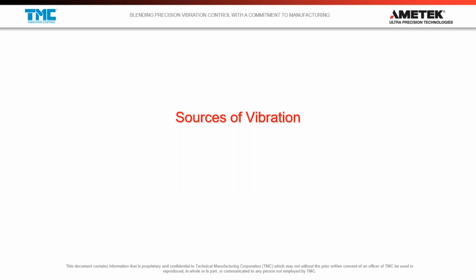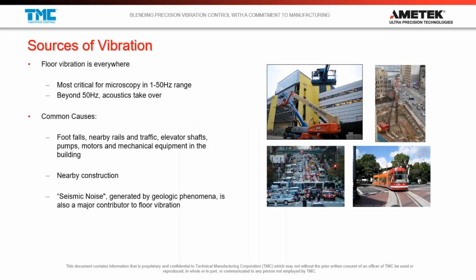So we know we have a lot of high precision instruments out there, and we know it's a very big problem and an increasingly larger problem over time. Now we're going to ask ourselves, well, where does this problem come from? And the reality is floor vibration is everywhere. And it's most critical for microscopy in the 1 to 50 hertz range, but we'll talk about frequency of floor vibration a little bit later.